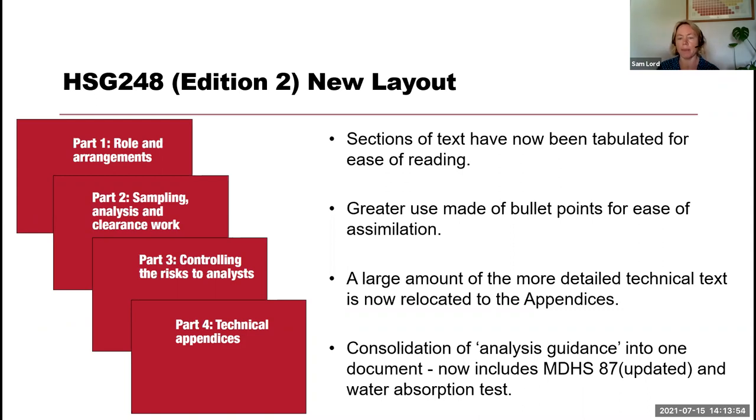And finally, those of you who are involved in bulk analysis: HSE previously had guidance in MDHS 87 for bulk analysis, and also the water absorption test, if you're unsure whether a piece of material is asbestos insulation board. That used to be in the ACOP, but all of that guidance is now consolidated into HSG 248. So it's a one-stop shop, if you like, for guidance for analysis.